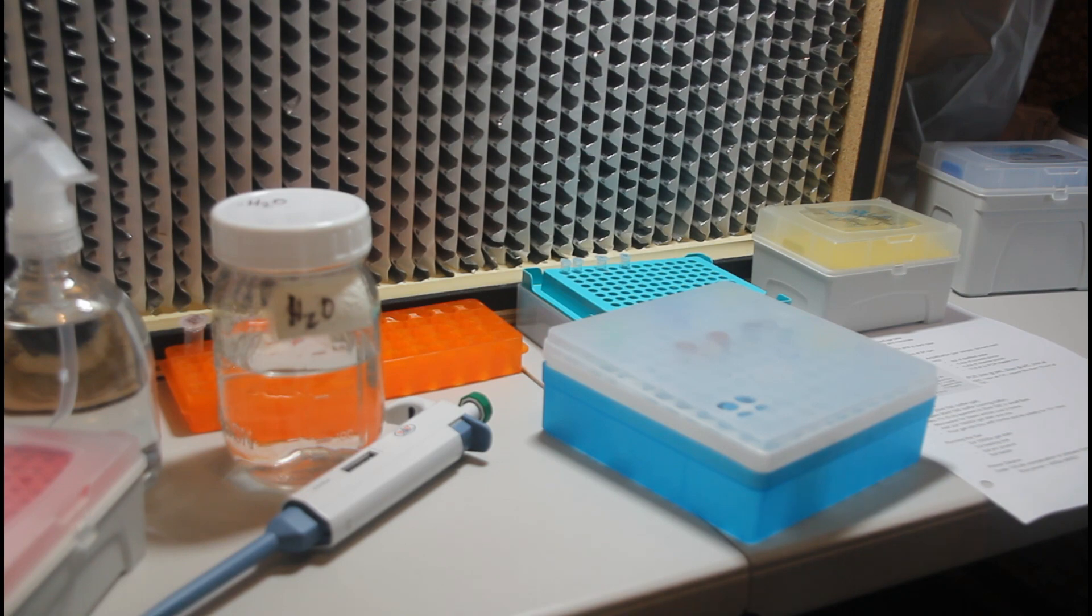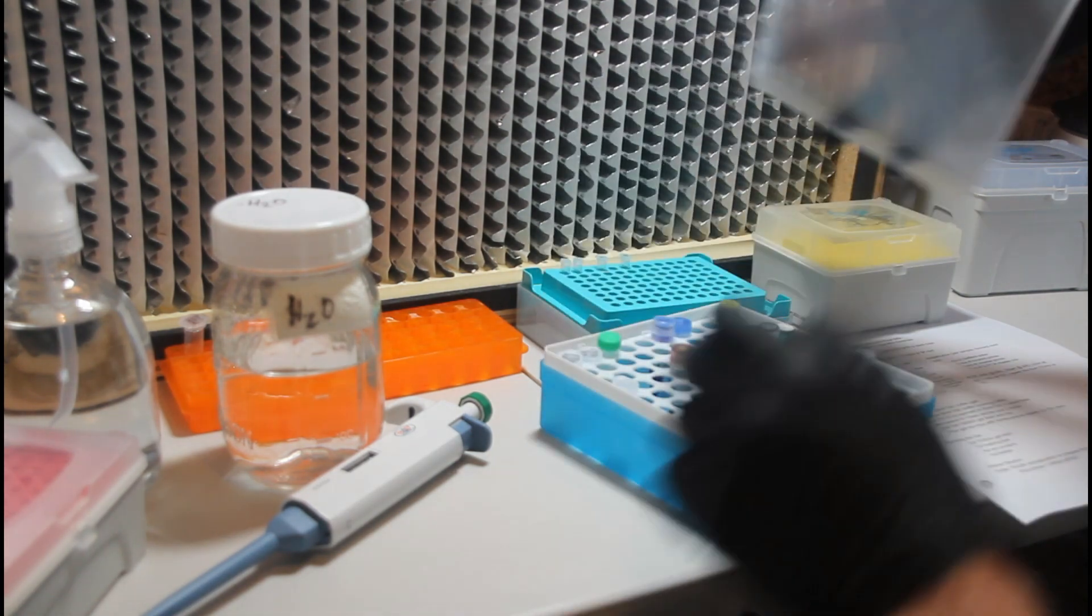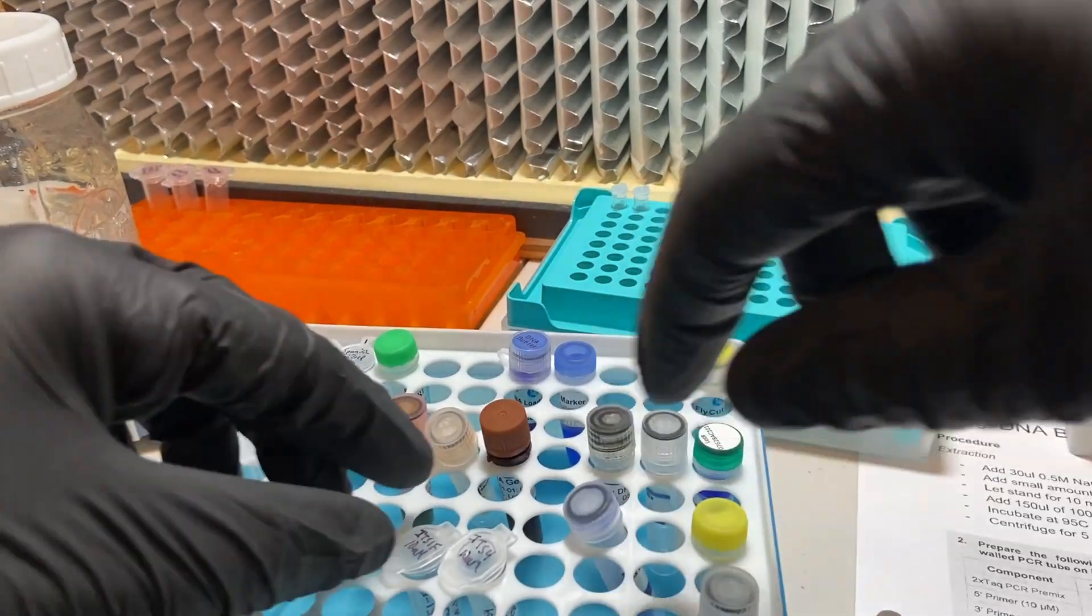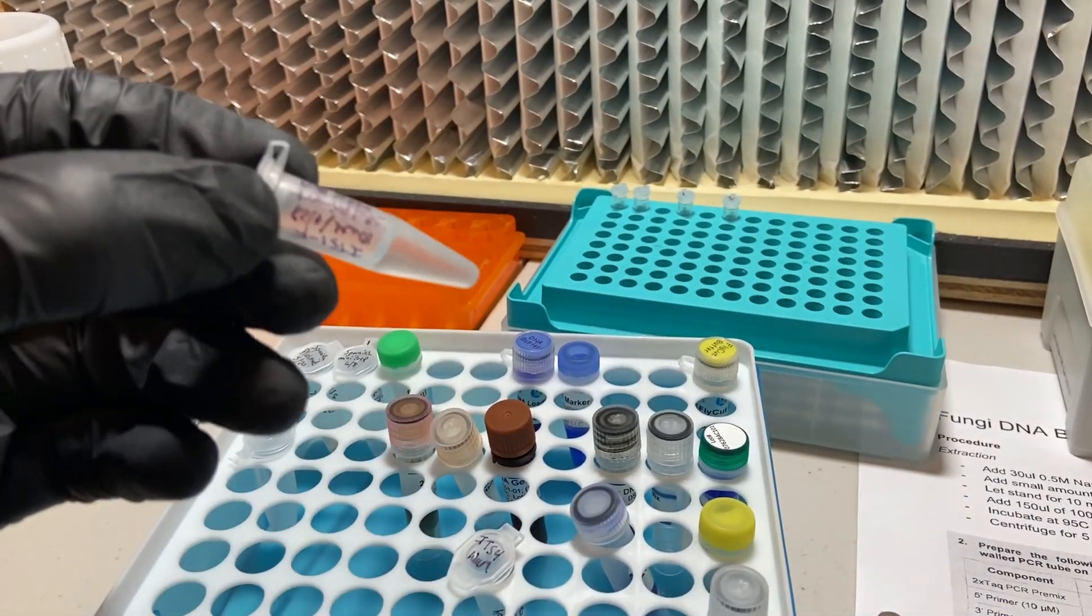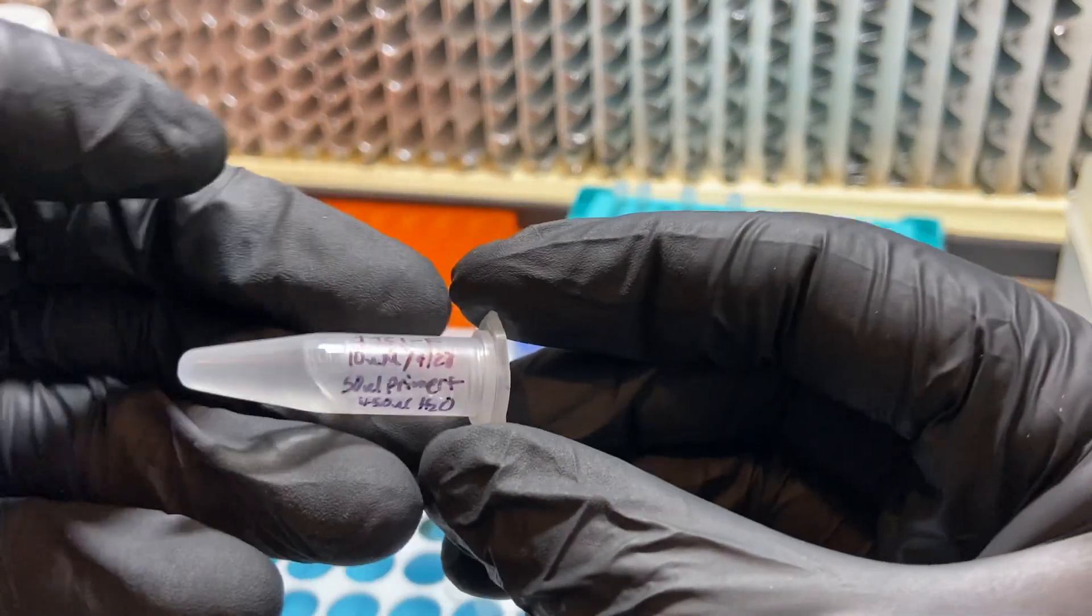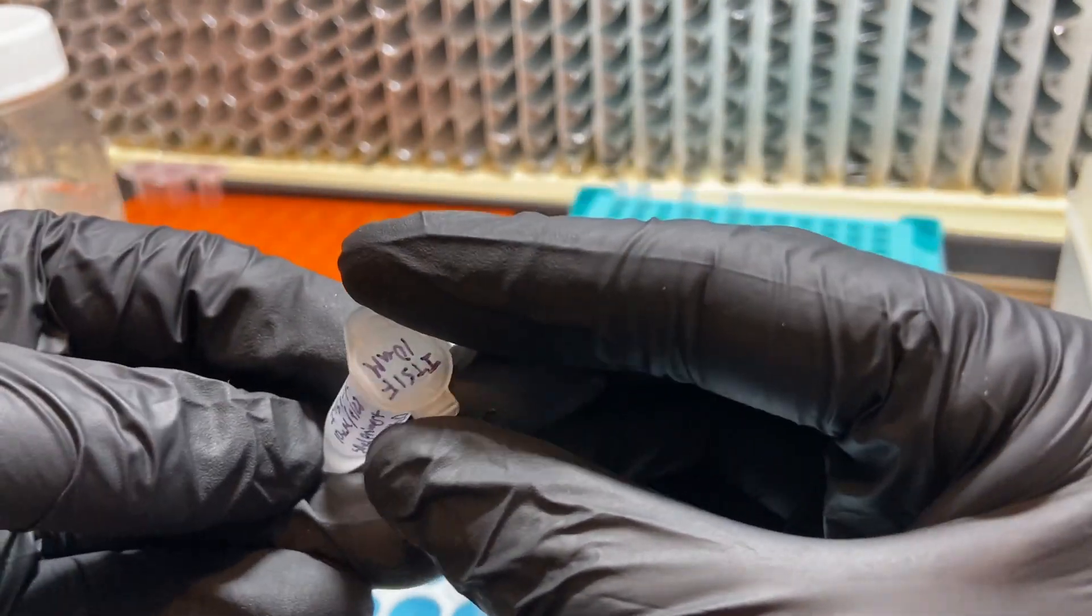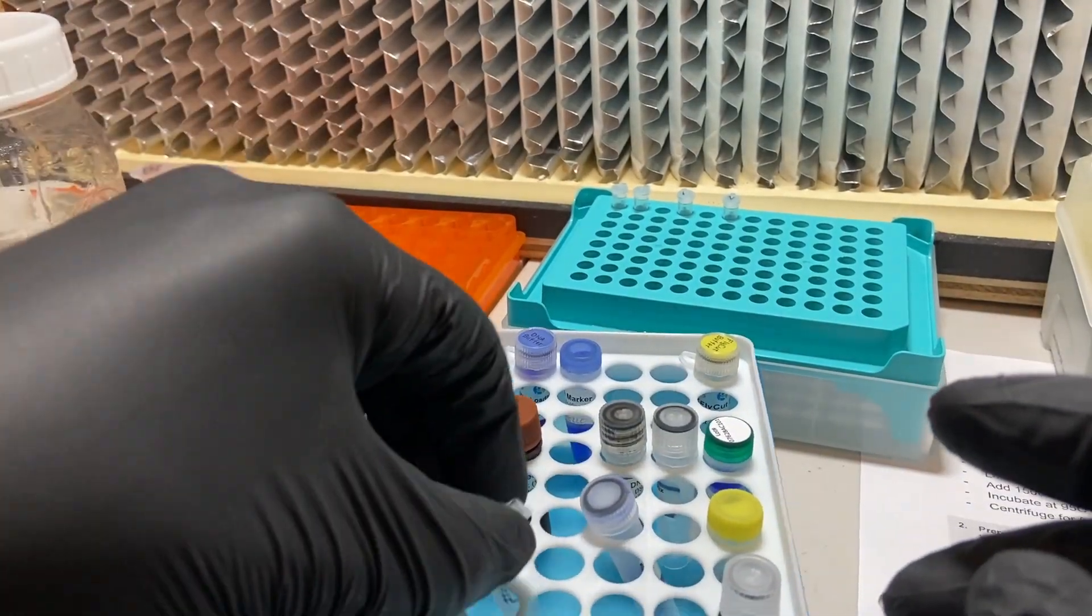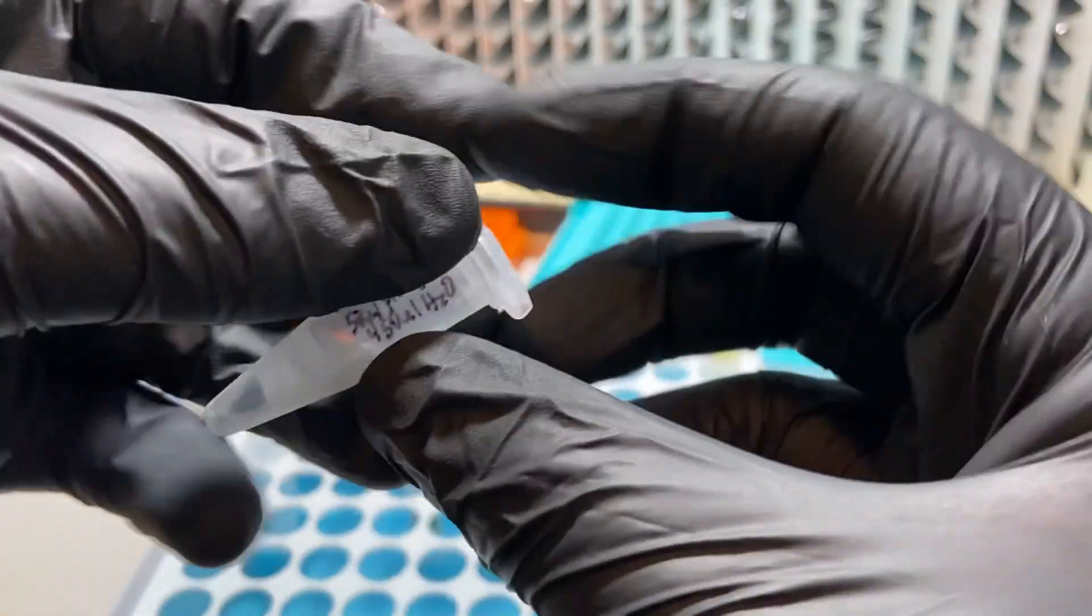After doing DNA extraction, we need to make enough copies of the DNA barcoding sequence so that there's enough to actually sequence. And we're going to do that using a technique called PCR. And this involves adding a forward and reverse primer. And these are just small nucleotide sequences that sort of attach to the beginning and end of the fungal genome that we wish to amplify.